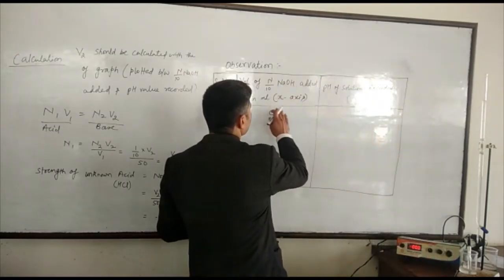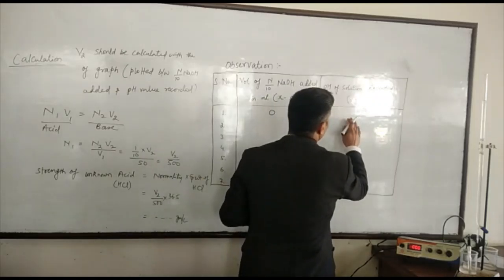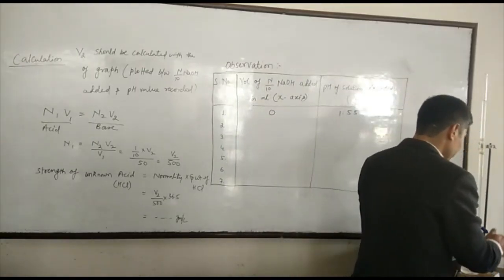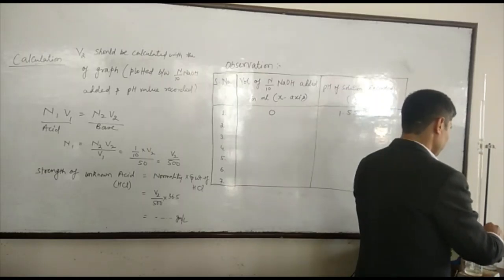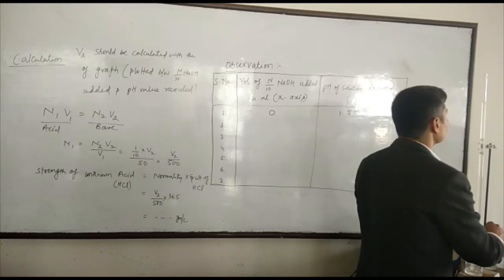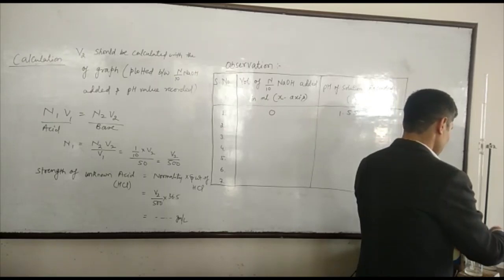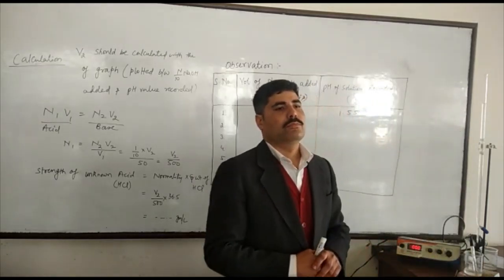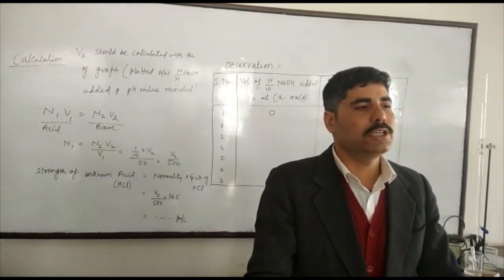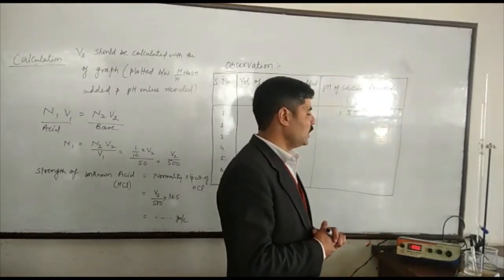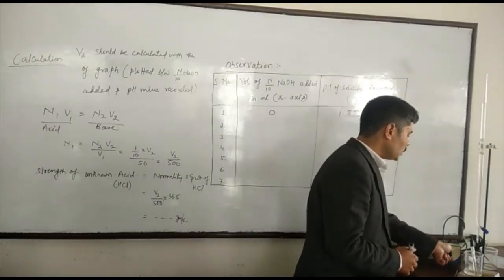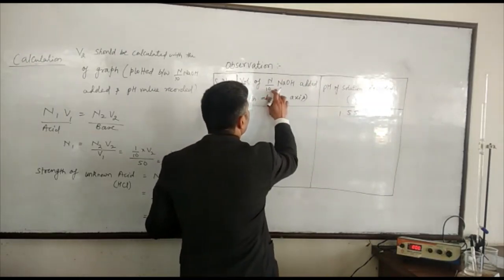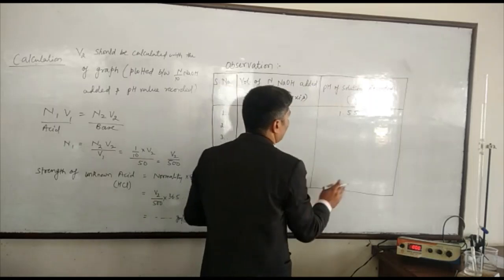The volume of NaOH added is 0 mL at the start, and the pH of the solution recorded is 1.55. Now we add 1 mL of NaOH to the solution and note down the readings in the observation table. After adding 1 mL of NaOH, the pH of the solution is now 1.85. So at volume 1 mL, the reading is 1.85.